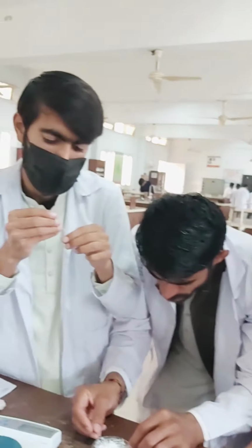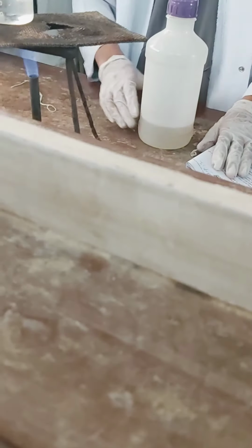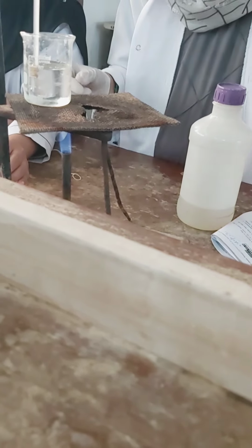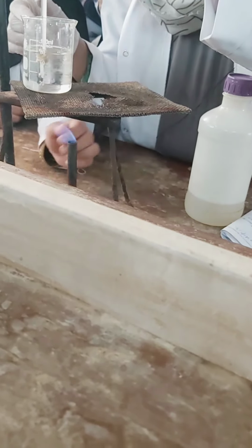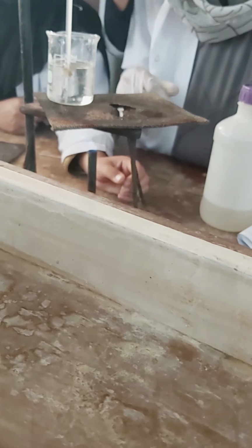These are the students who are doing it, and I'm happy that they are all engaged in their work with full concentration. This is the girls' side. They are also doing it, and this is their assembly. The thermometer is not correct; it is touching the side of the beaker. It should be hanging in between, should not touch the bottom, and should not touch the sides of the beaker. Be careful. Arrange the assembly properly.